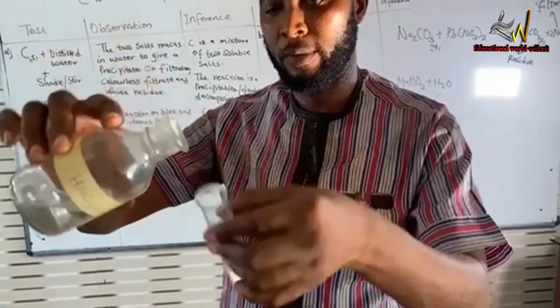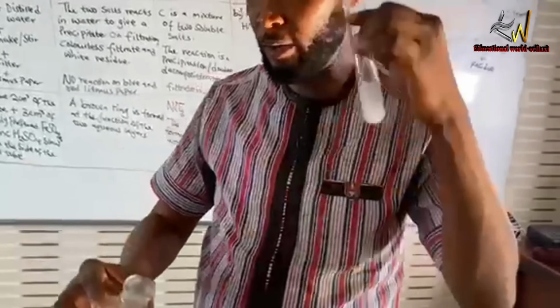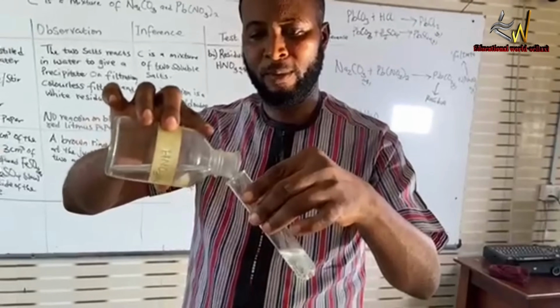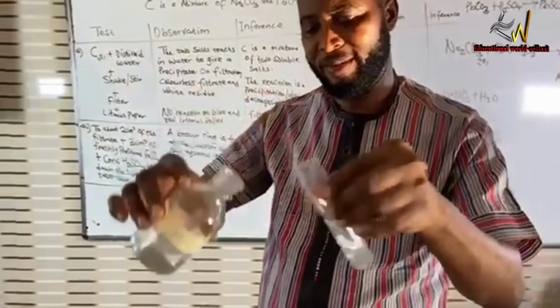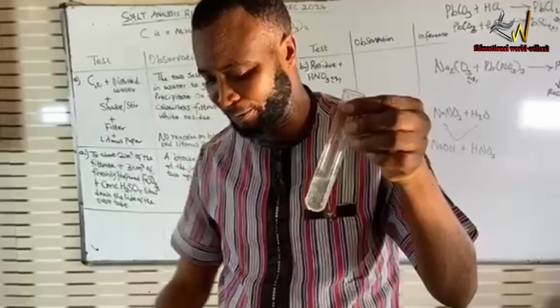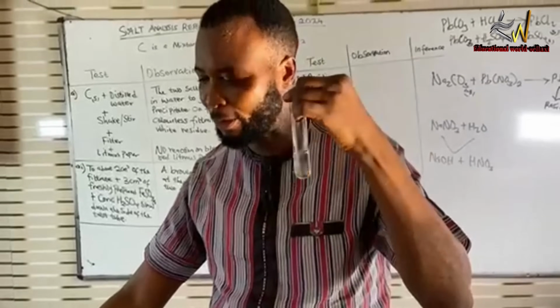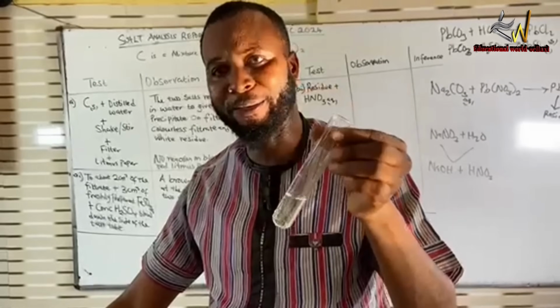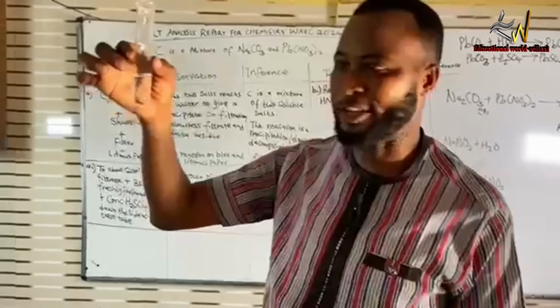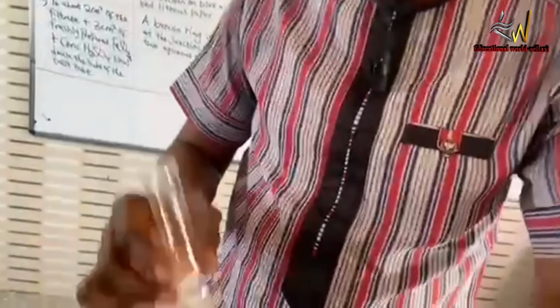Wow. It can dissolve to a colorless solution. Effervescence occurred, still occurring. Beautiful, to a colorless solution.